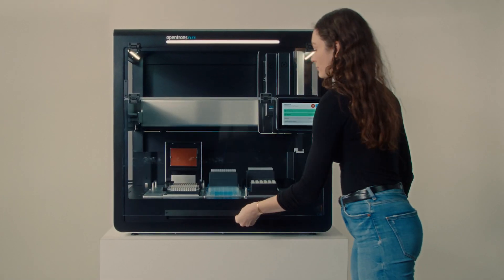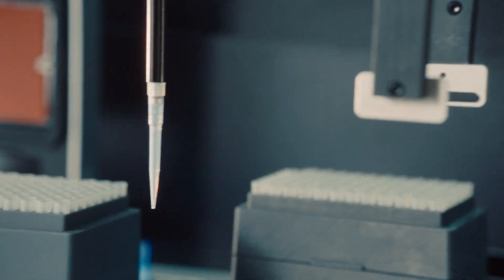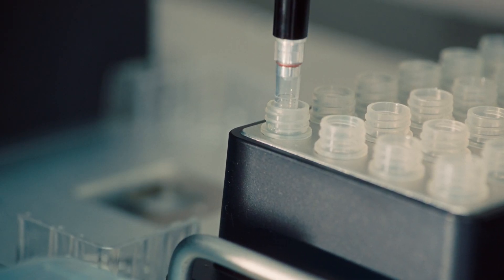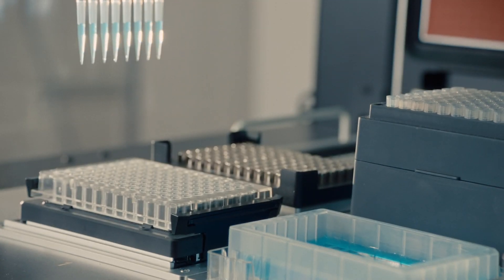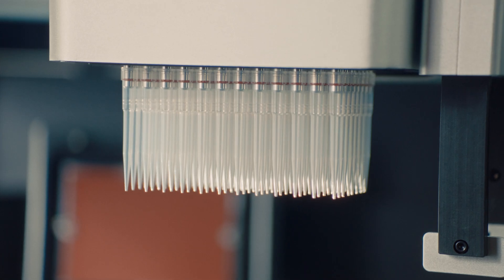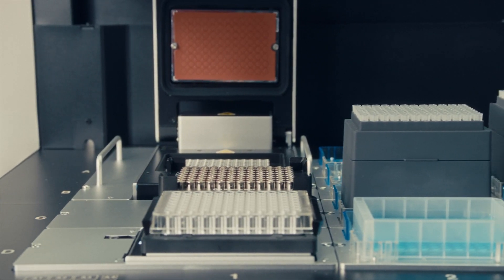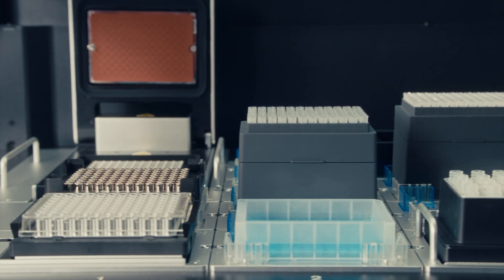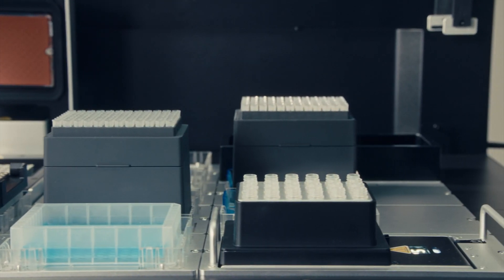The Opentrons Flex is the next generation platform from Opentrons. We'll have single and multi-channel pipettes ranging from one to a thousand microliters. We'll also have multi-channel pipettes and enabling a 96 channel pipette as well. On the Opentrons Flex we have 12 flexible deck slots which can house various labware, reservoirs, and tip racks required for your particular protocols.